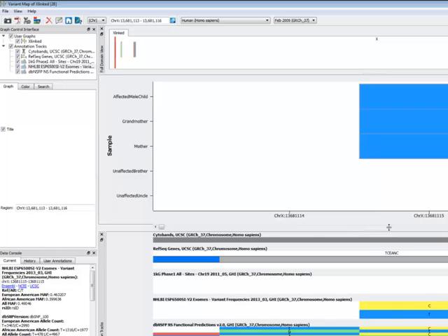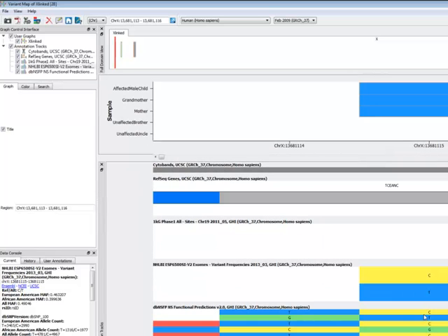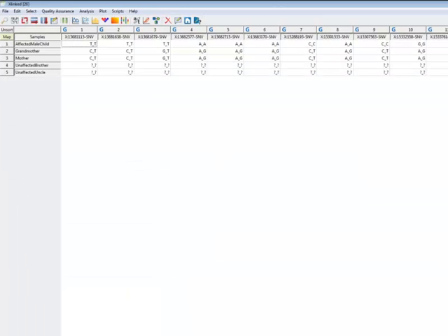Something we'll talk about. And this one also is non-synonymous, and I can come down to my prediction track and see SIFT calls it tolerated, and there's a number of other algorithms to look at. But what I really want to do is evaluate them all and create a table so I know more about all of these 67 variants.